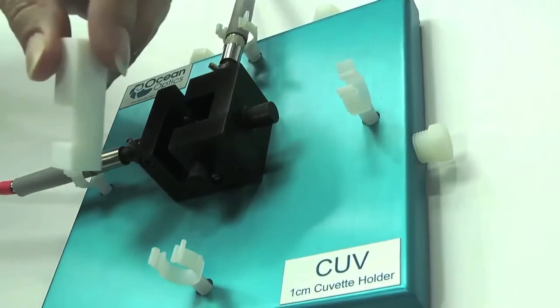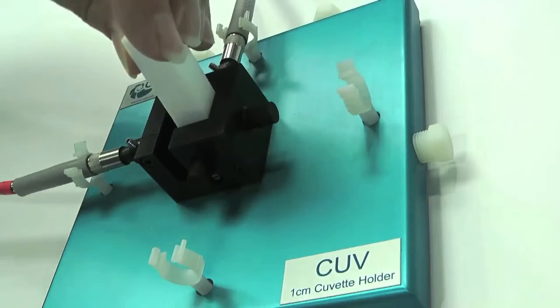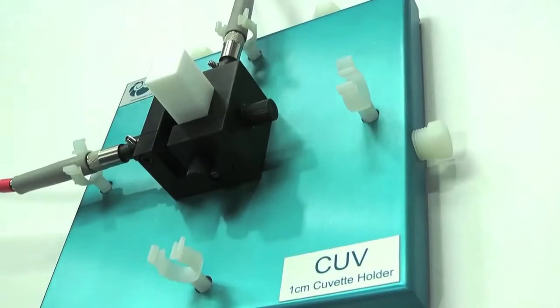The CVD diffuse reflectance standard can be inserted into the cuvette holder with the diagonal surface facing towards the two fibers in order to take a reference.